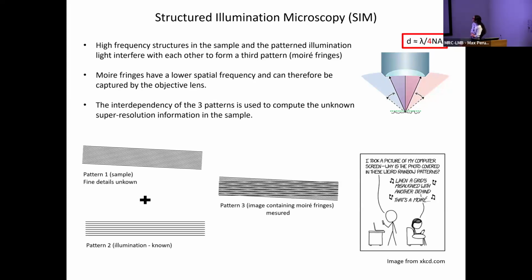first I have to explain how the light is collected by the lens. When you have an object, like a sample here, that emits light, it emits light in every direction. So you have fluorescence that goes in every direction, which you can see as rays of light, at every angle. Now, when you have a lens on top of your sample, that lens only has a certain capacity for picking up that light. So it doesn't collect absolutely everything. It just collects a portion of it, what it's capable of seeing, basically.